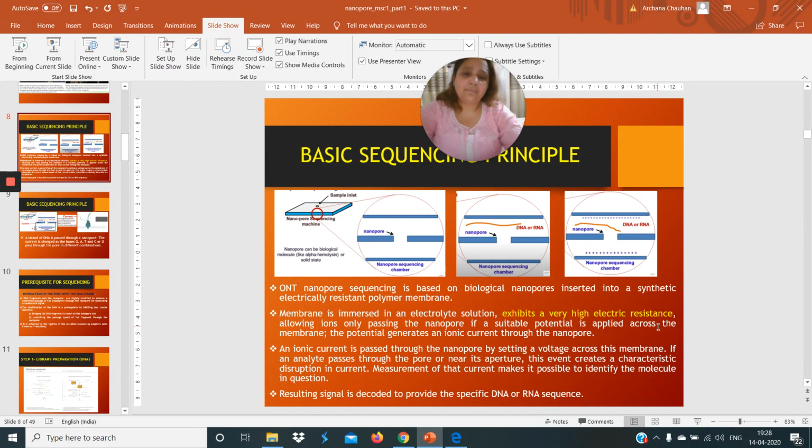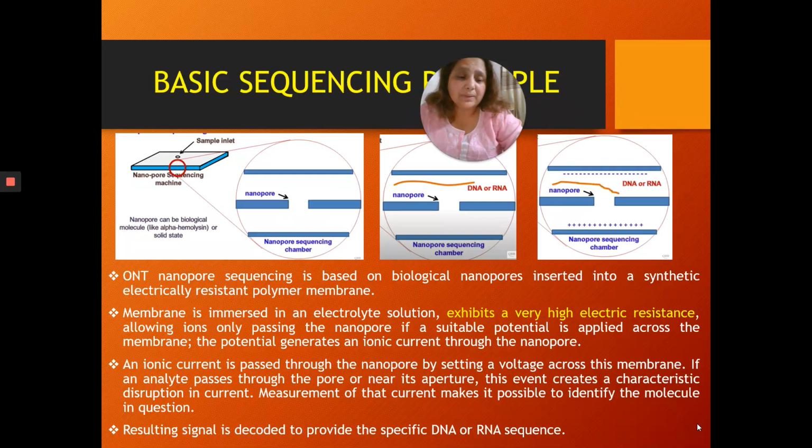Hello. Now, welcome to the next part of my talk on nanopore sequencing. This next part deals with the basic principles of nanopore sequencing. So, what is the basic principle of nanopore sequencing? We will be talking about that, and then we will be moving further deep down into nanopore sequencing.